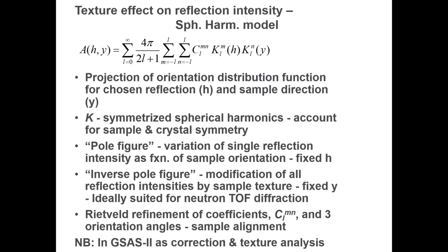Okay, how do you describe this? Well, you use something called the spherical harmonics model, and here's the equation for it. Now, you may say, what are these things? Well, first of all, what you see is basically a projection of this equation along either a given HKL, that's the H, or a given sample direction, that's Y, which will then dictate what the correction is for that particular structure factor.